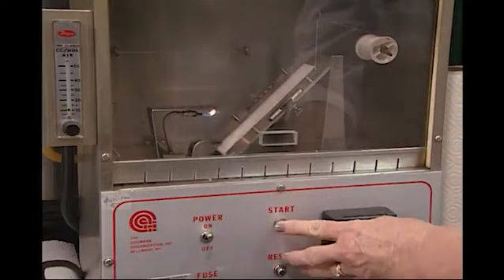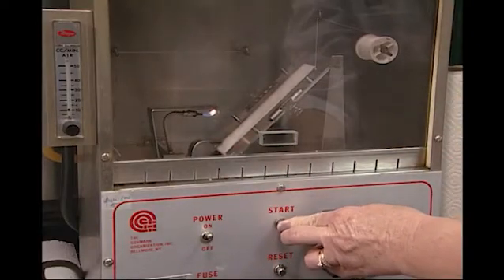In the open area, a specified flame can be activated to touch the surface of the specimen at its lower edge at a particular location.